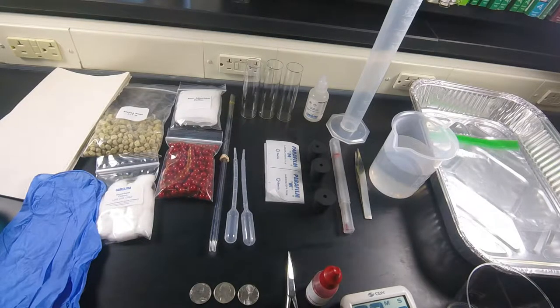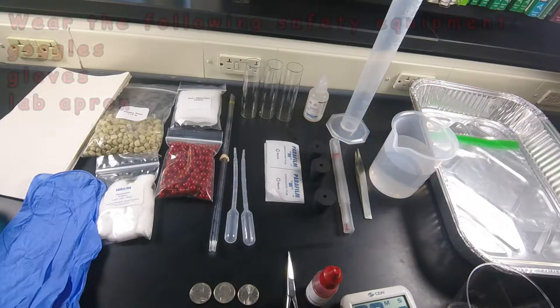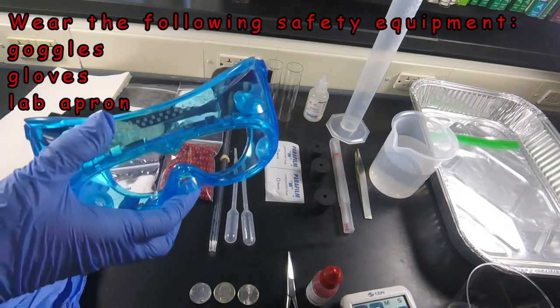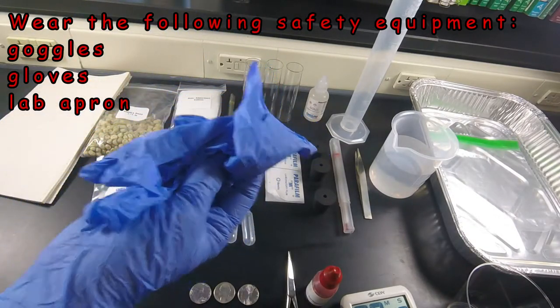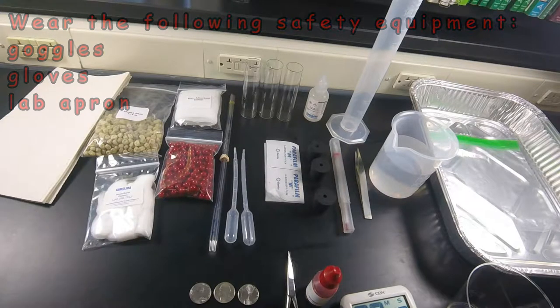This is the setup for cellular respiration in germinating peas. Before you begin, please make sure you read all of the safety instructions found in your lab. Also remember to observe all safety precautions, including wearing your goggles, gloves, and your apron.